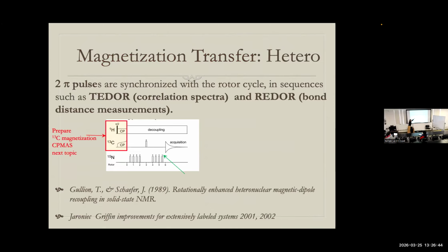Then I'm here in the X direction for carbon. And what I'm doing here is I'm spending some time on the X-axis. I use a pi pulse in the middle of this period to refocus any chemical shift that might be going on. So I'm just sitting there in the XY plane, mainly along X. And coupling to the nitrogen would have been ineffective due to magic angle spinning.